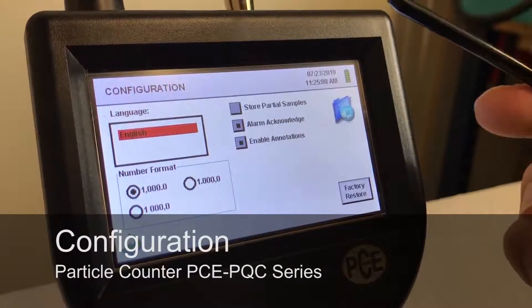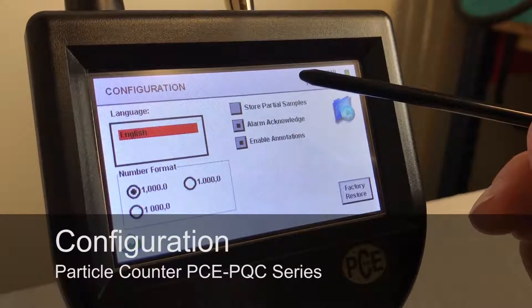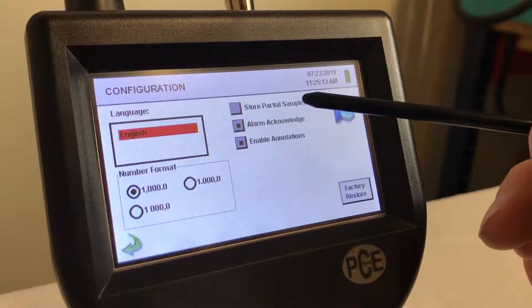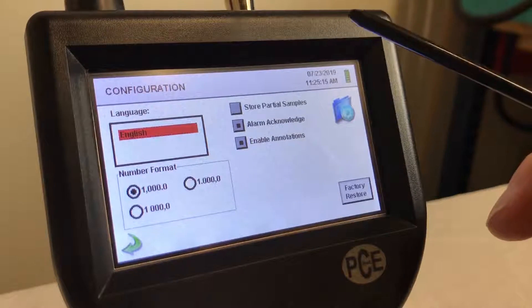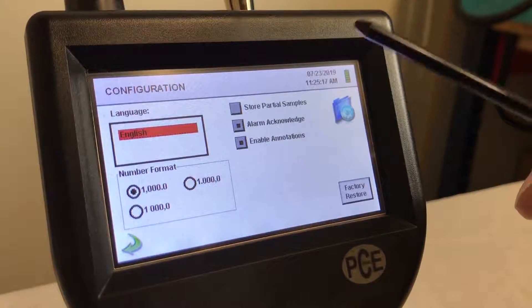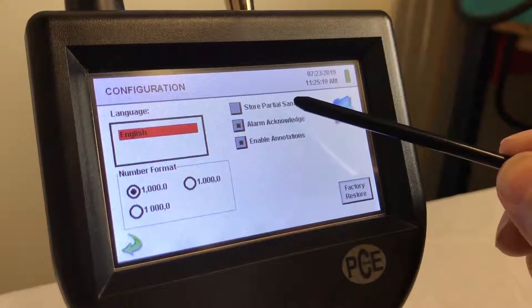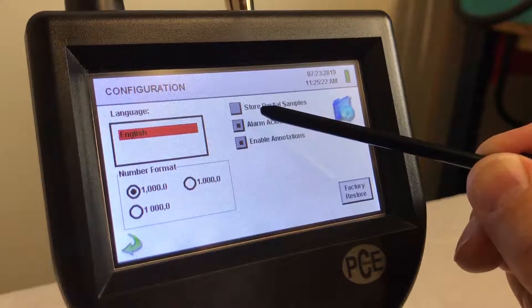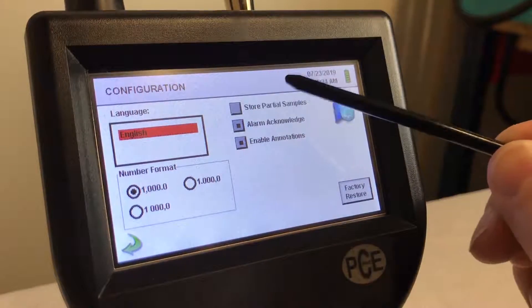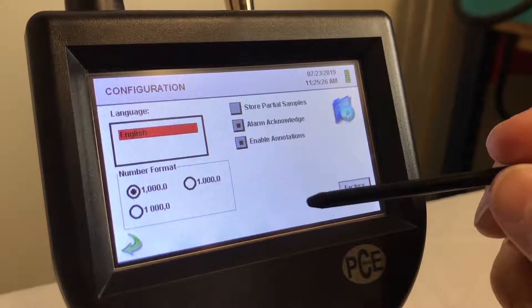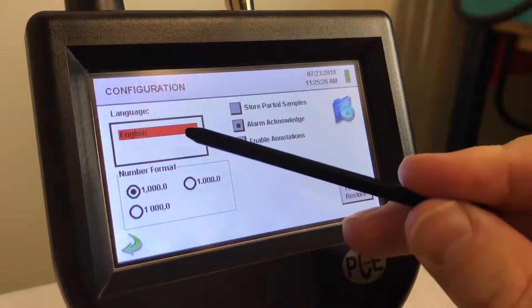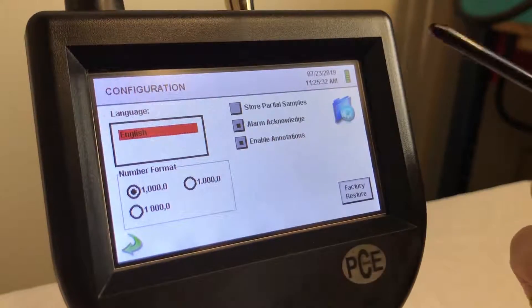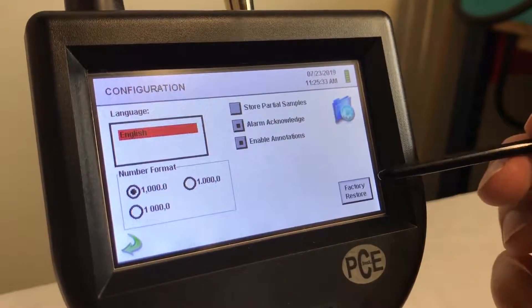Configuration — it's going to automatically store into the memory, which stores 45,000 records. It's going to automatically store those as long as they're full. If you run a partial sample, it's not going to store it unless you select right here. You can also change your language and your number format right here. Here's your factory reset as well.